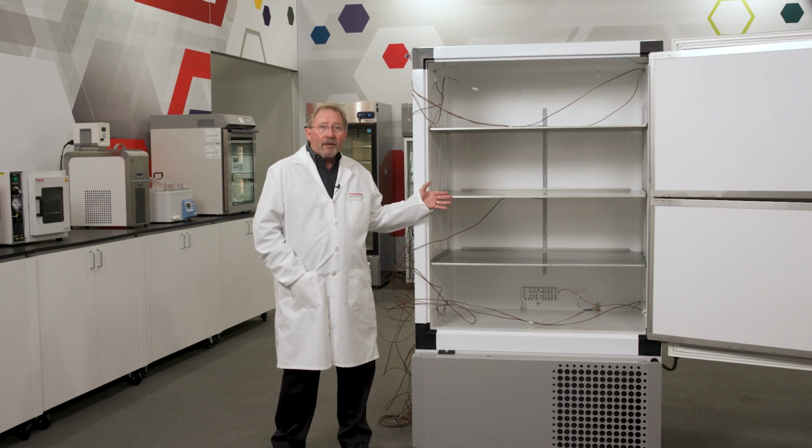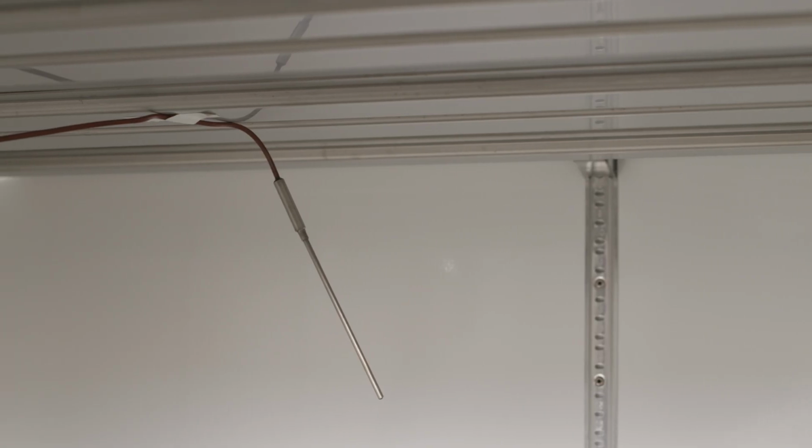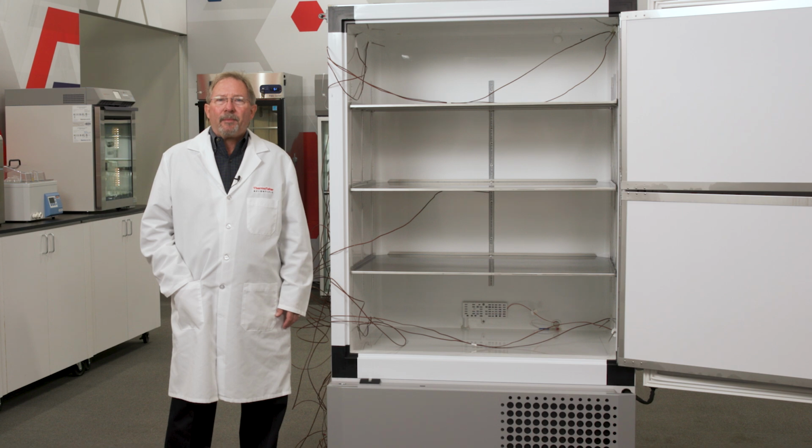Now here is one example of good probe placement. All of these probes are uniformly placed. No probes are touching the walls or laying on the shelves. They are also secured so that they will stay in place for the duration of the test. Keep in mind that this is only one way to attach probes. Do what is best for your situation.